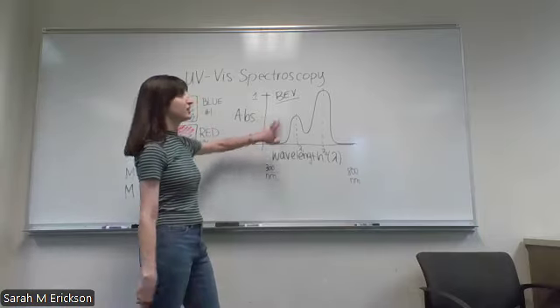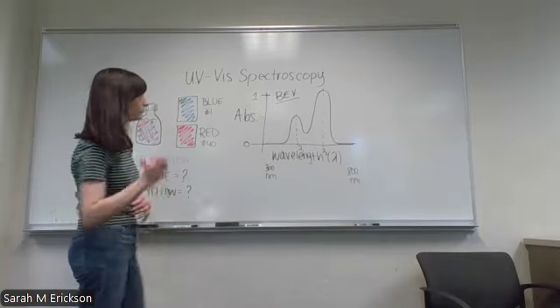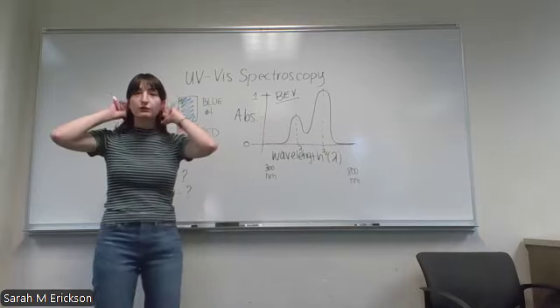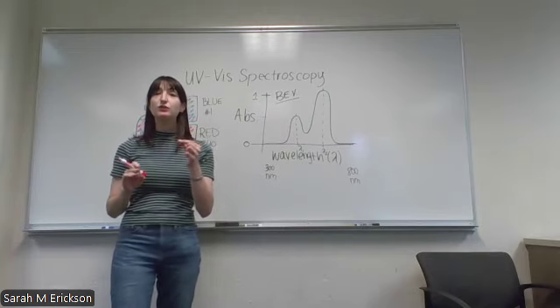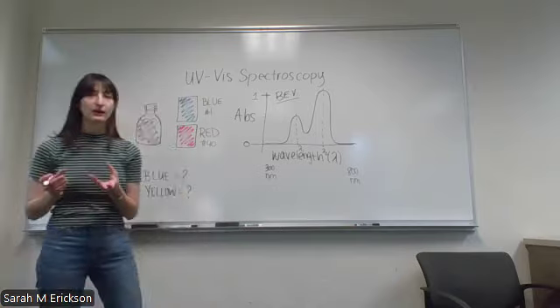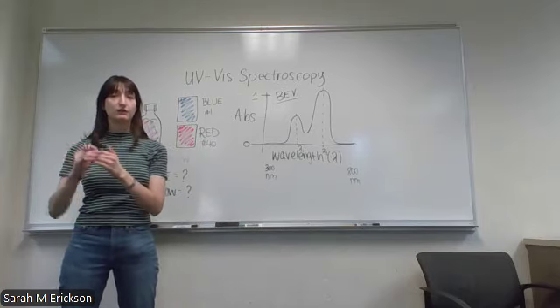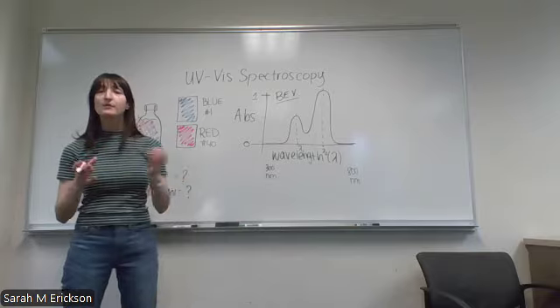And this is just a regular drink spectrum right here. Well, maybe if we cut the concentration of our drink in half, so we dilute it, we add some water. And you can just think about this visually, right? If you pour a bunch of water into something that's a really dark food dye color, that food dye color is going to get lighter because more light is able to go through it. And it kind of makes sense if you think about it too, right? Because if you have a dye molecule and it's absorbing light, if there's more dye molecules, something can absorb more light. So there's a higher concentration, it absorbs more. And if there's less dye molecules or there's a lower concentration, then it absorbs less light.